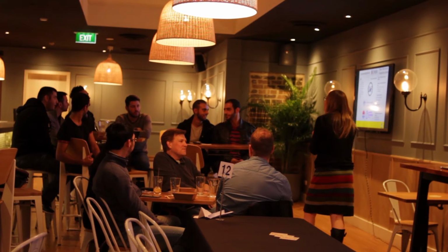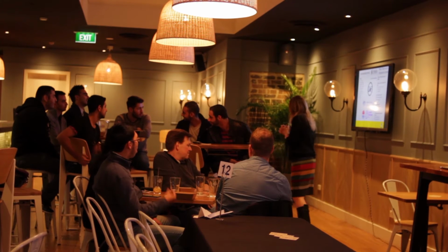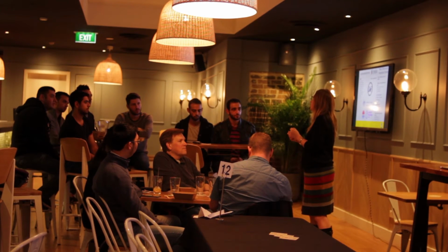What do you see as the next frontiers in microscopy? Next 100 years? I think most of it now comes down to two things. The first one is education. There are lots of people who think that when you look down a microscope, it's like a camera, you take a picture and that's it, done and dusted. I think there are lots of people who don't get that right, and that needs to go through a lot of change.